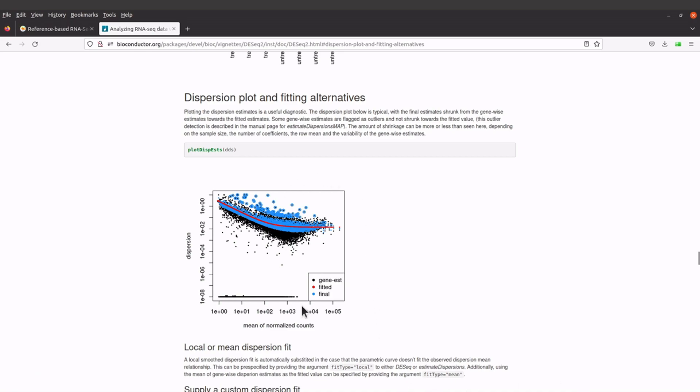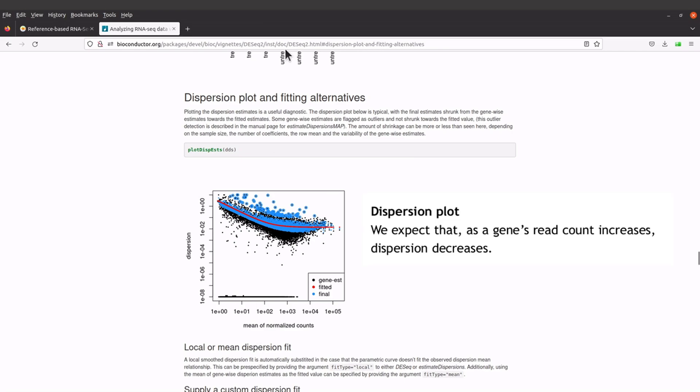This is how a typical dispersion plot will look like according to the DESeq documentation. If you have a plot which is different from what is here, it could be due to a number of factors. The sample size, the number of coefficients, the row means, and the variability of the gene-wise estimates or effects can affect or influence the plots that we generated.